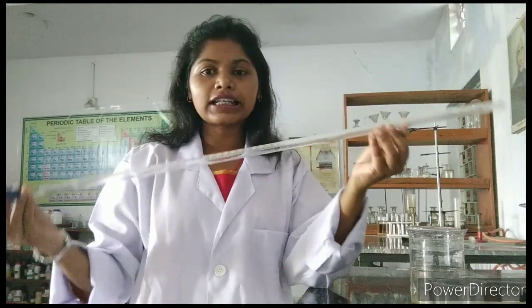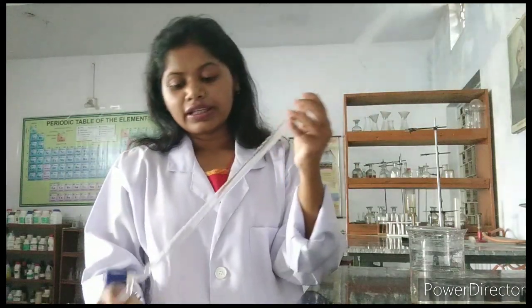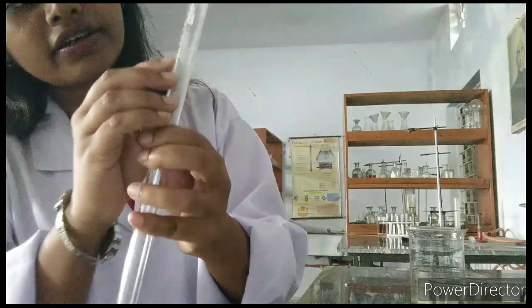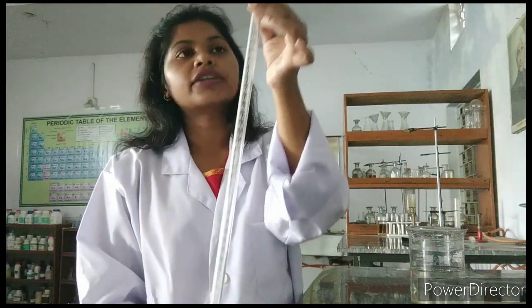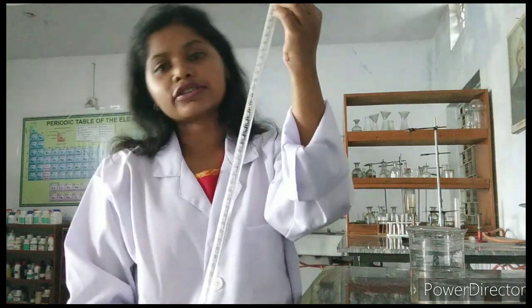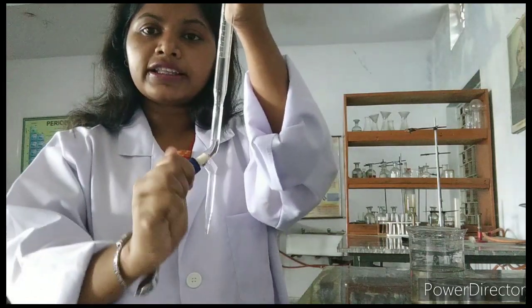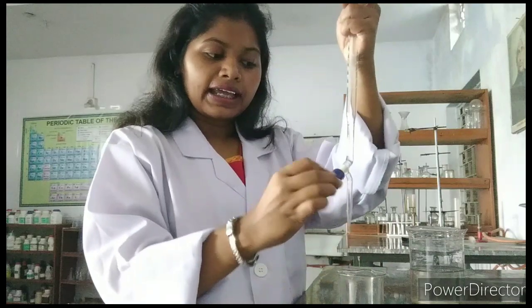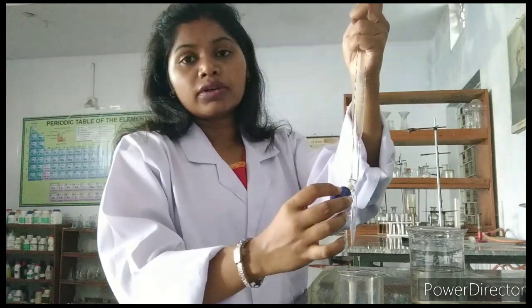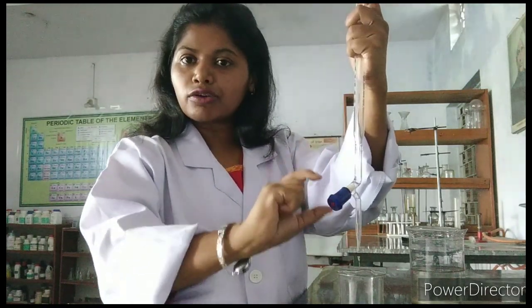Now I have taken another glass apparatus. This is called a burette. Its measuring is from 0 to 50 milliliter. So 50 milliliter of solution you can keep in this burette and do your practicals. Here you can see there is a knob — you can loosen the knob and the water can go out drop by drop. If you don't want to release water, just close the knob by moving it clockwise to close, anti-clockwise to open.